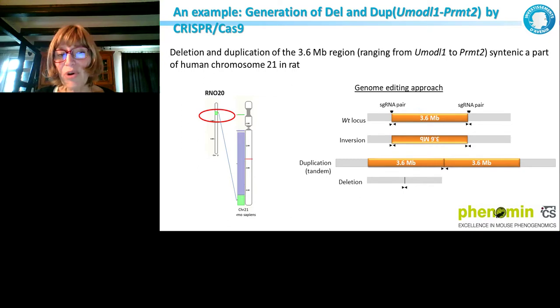And this is the approach that we undertook. We undertook this approach, again, like doing knockouts. We used pairs of guide RNA simply because we thought if one guide doesn't cut well, the other one will cut. And as you want to delete something that is large, it would work. And we designed primers all over the regions to be able to check if we see inversions, duplications, or deletions.